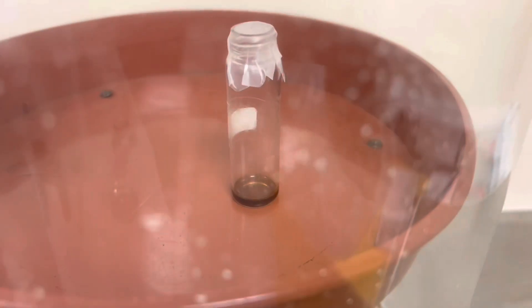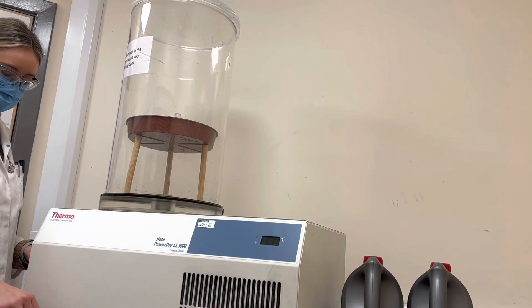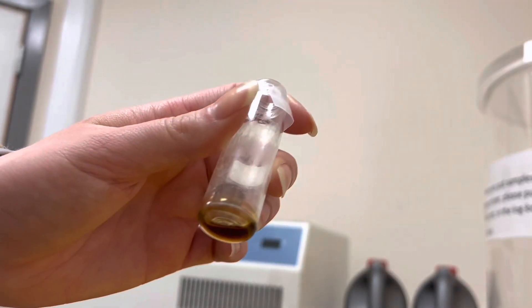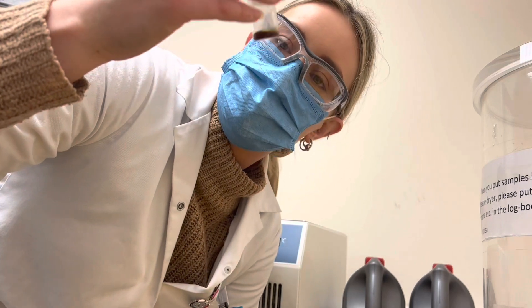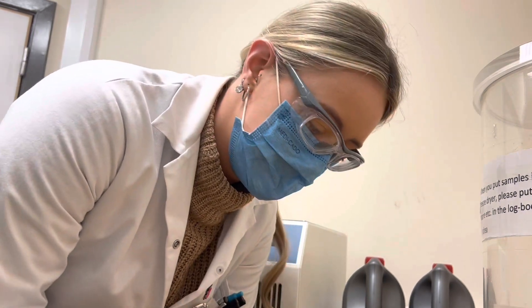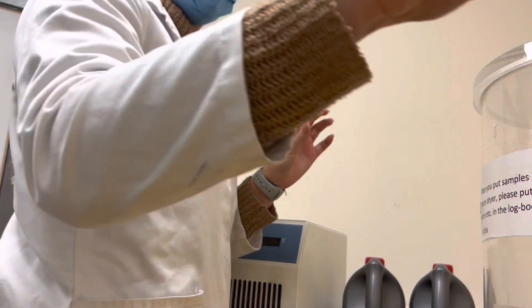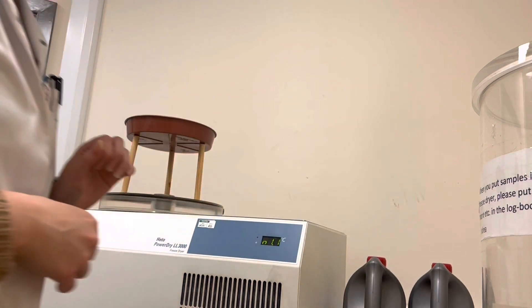My sample is in here and I don't know if that looks dried, to be honest — I need to open up and have a look. My sample is liquid, so now I'm going to need to put it back into the freezer to freeze and then try to freeze dry it again. I think it melted when it went into the system and that's why it's not actually freeze dried — it wasn't frozen and it melted. Anyway, I'm going to start this back up again and hopefully it'll work, but this is the sample I was going to use today, so not very useful.